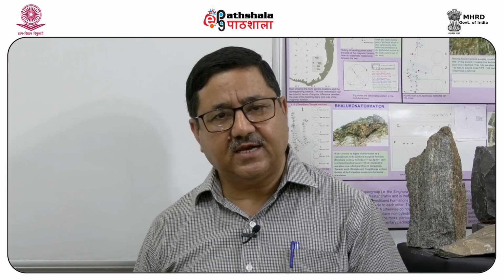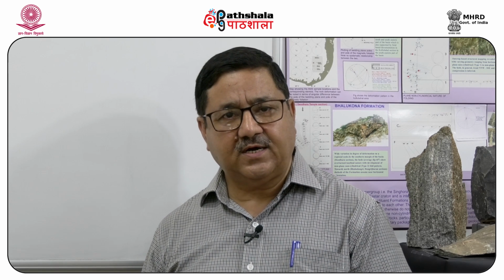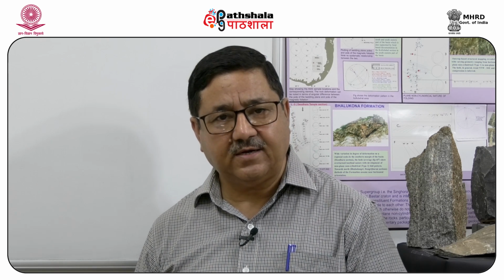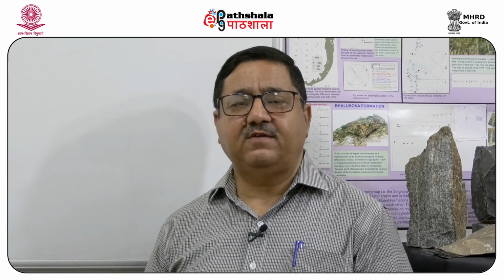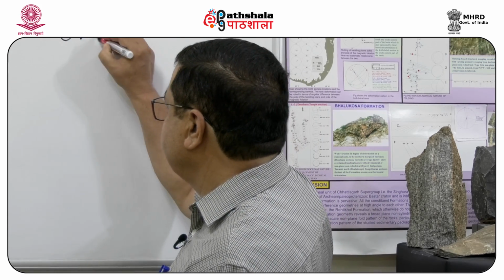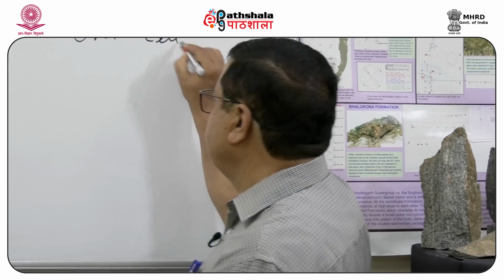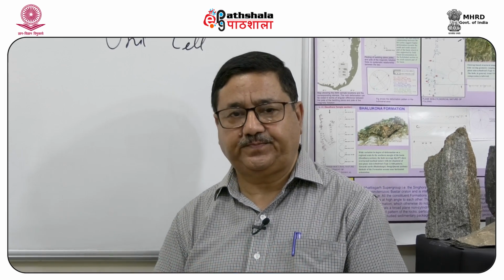A crystalline material can be considered as a regular, ordered internal atomic arrangement which can be produced, within quotes, by infinite repetition of a unit. That unit is known as the unit cell. We say infinite repetition because the unit cell is very small, in terms of angstroms.